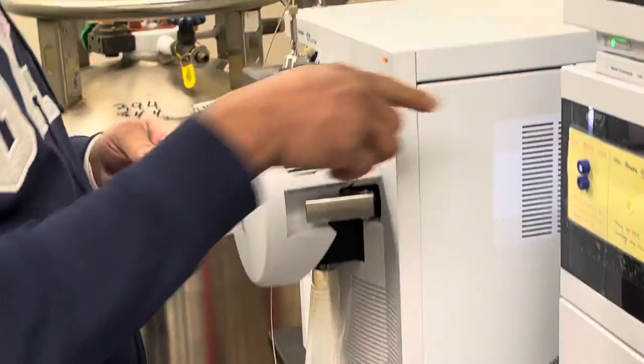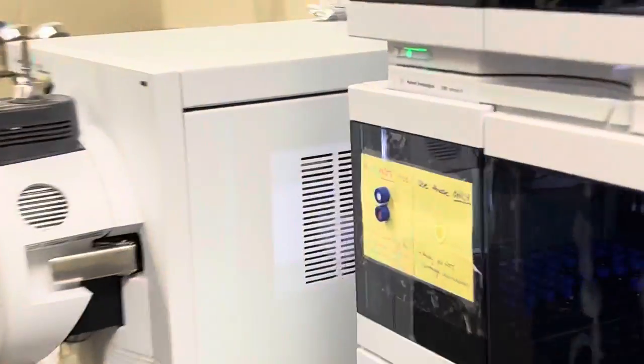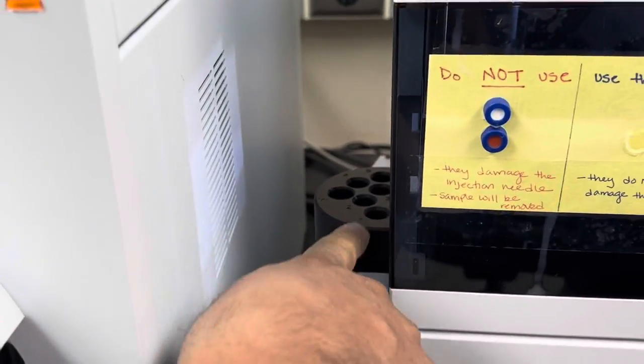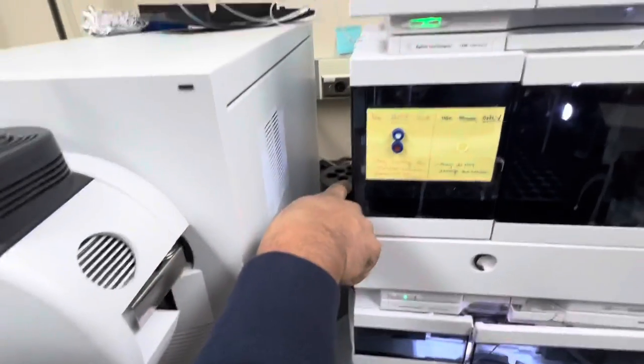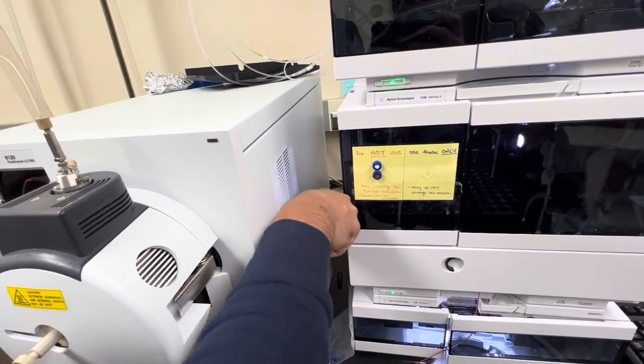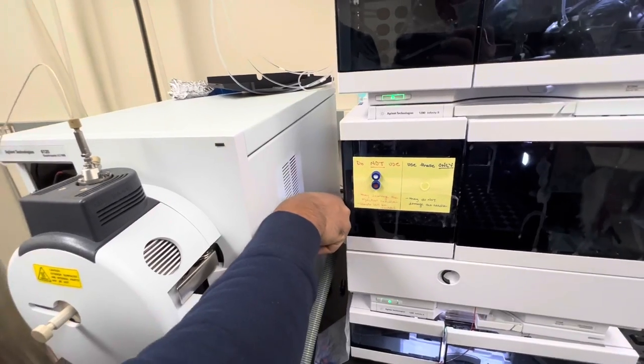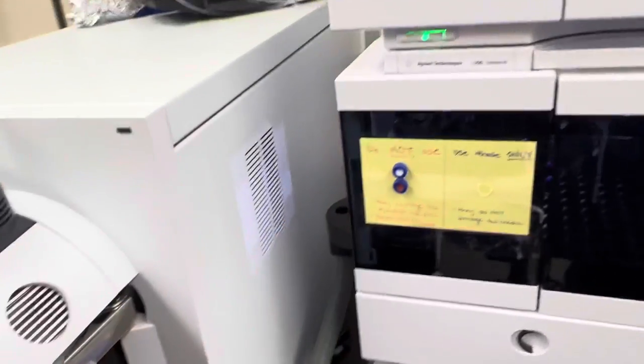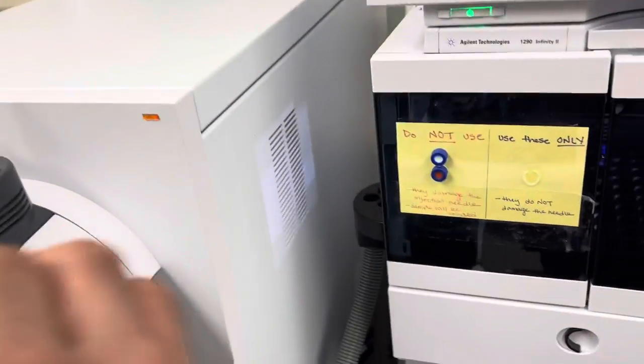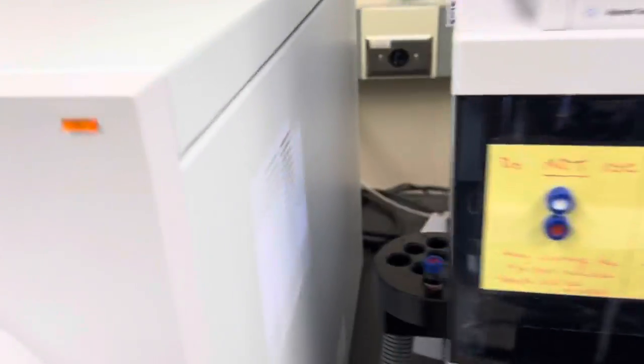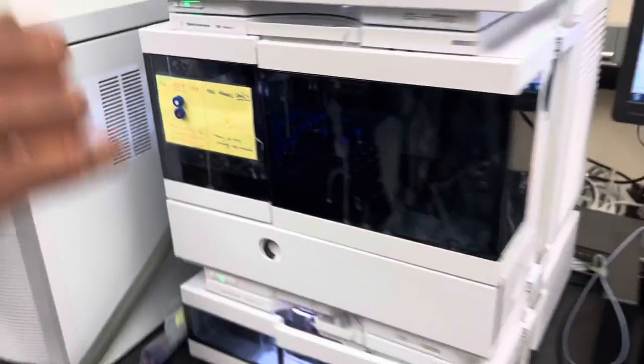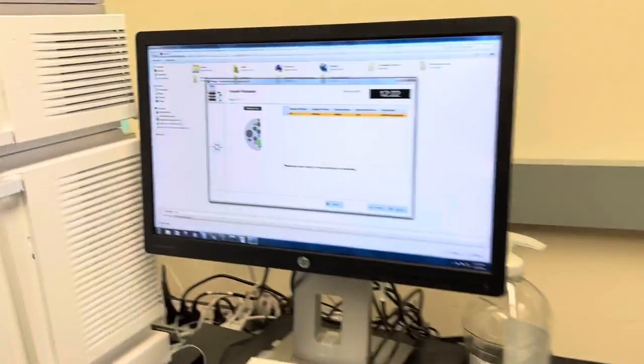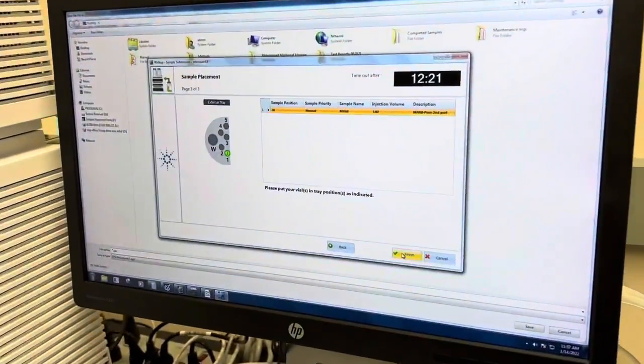So if you come here, here, so you will see this is one, yeah, this is two, this is three, this is four. Oh mirroring, okay, or not mirroring, it's the same thing. Yeah, so you have to put this one here.